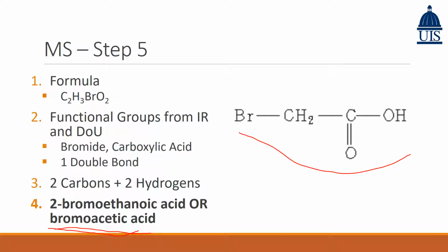So there we go. We used both the tools of MS and IR to distinguish our functional groups and elucidate some sort of structure that could be possible with the information given.